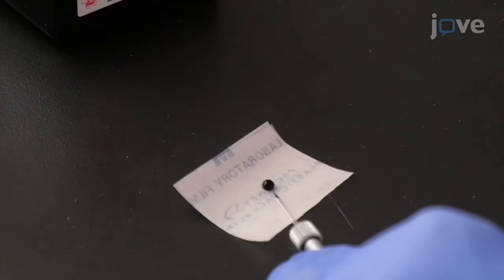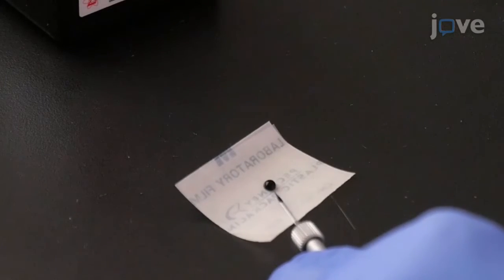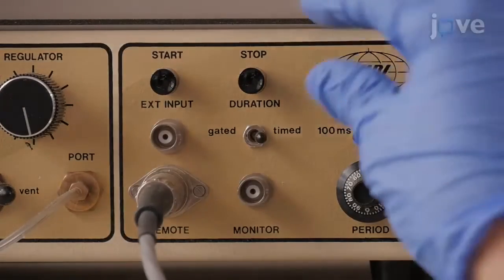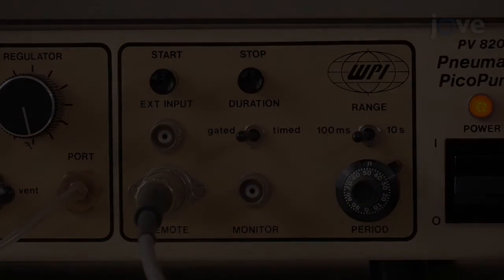Next, load a new needle with 0.4% trypan blue solution, and set the pneumatic injector to gated to allow a constant flow of the needle.